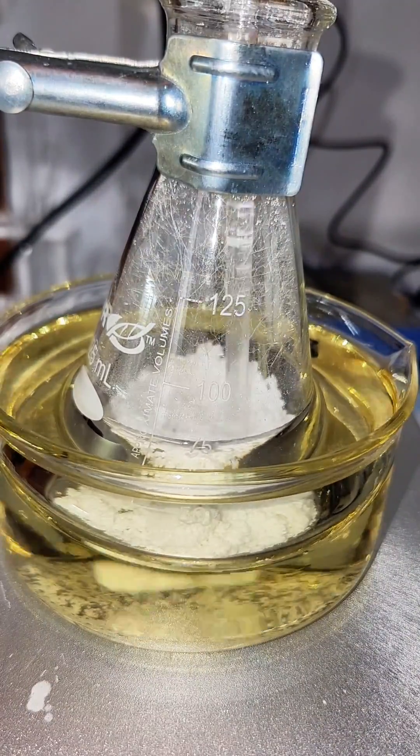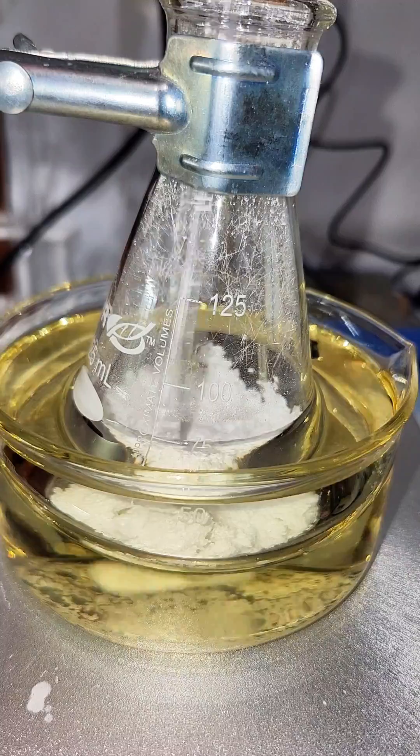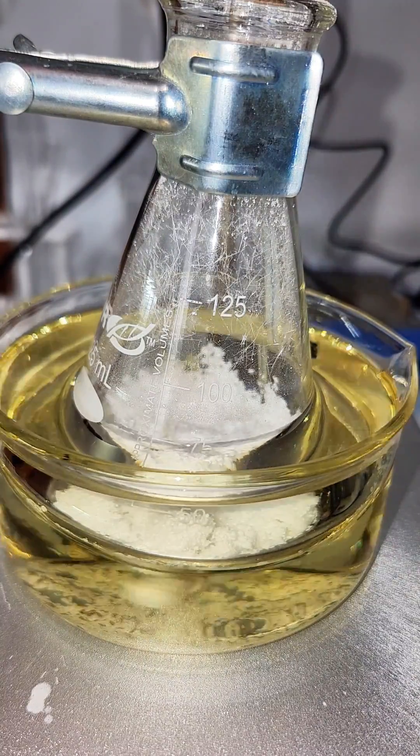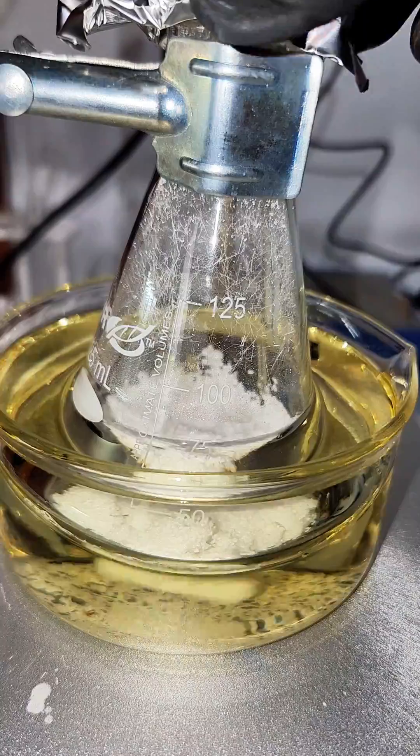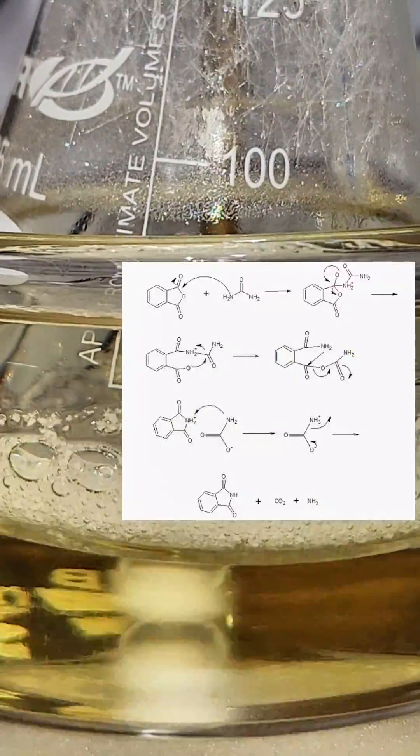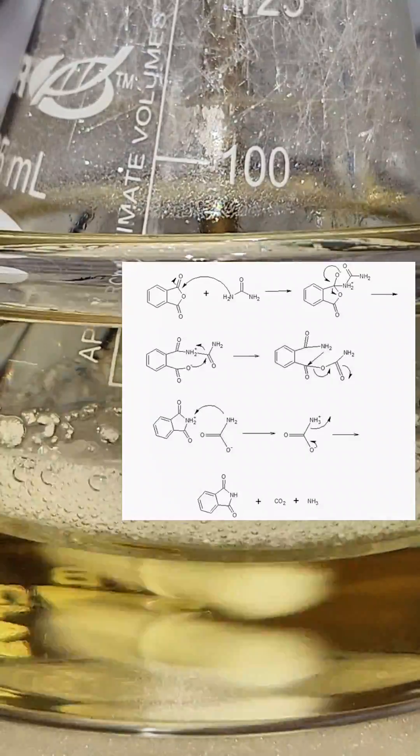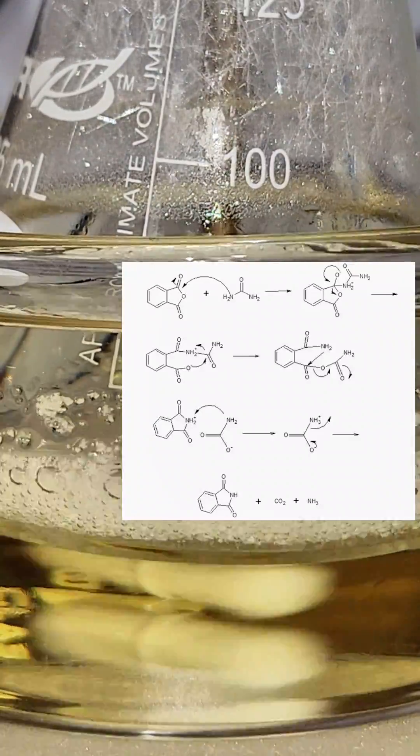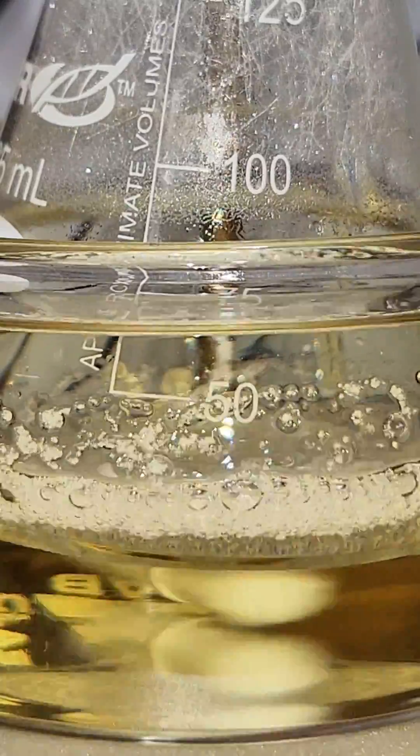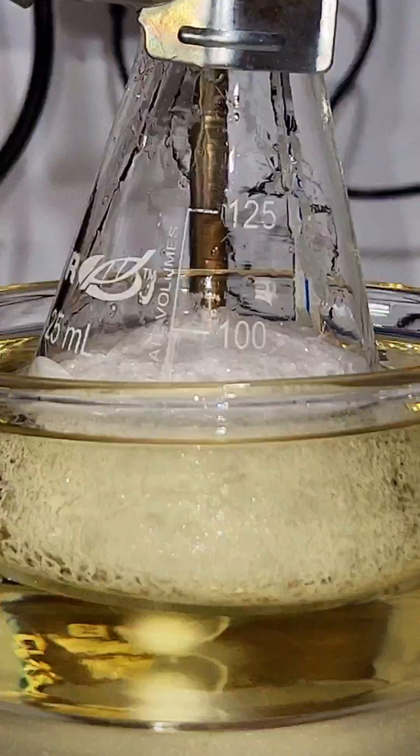The reason the two are able to react is that the carbonyl group on the anhydride is extremely electrophilic. This carbonyl is attacked by the fairly nucleophilic nitrogen in the urea, which sets off a series of proton and electron transfers. This results in phthalimide with an extra hydrogen as well as a carbamate ion. This carbamate ion reacts with the extra hydrogen and then breaks apart into carbon dioxide and ammonia gas, which float away.